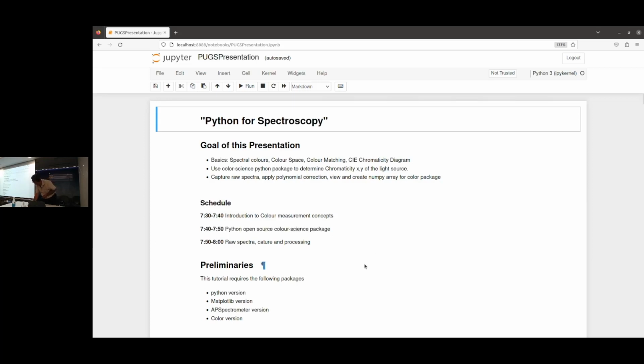I've organized my presentation in roughly 3 different chunks. I hope I'll take 10 minutes each. First one may take a little longer. I will just go through basic color measurement ideas as they're prevalent today. But primarily we are looking at the Python color science package, and I'll be using some of it for demonstrating how we do things for color measurement in it.